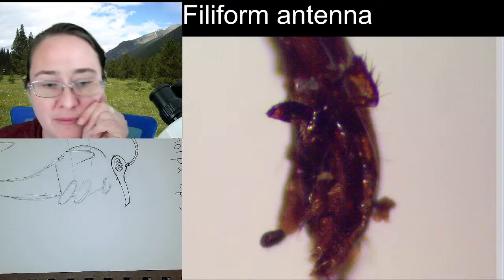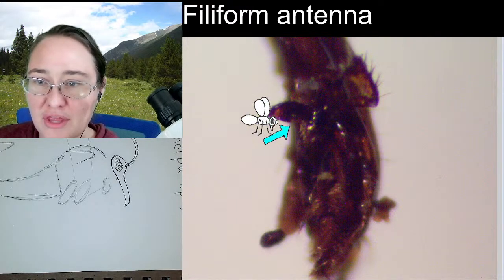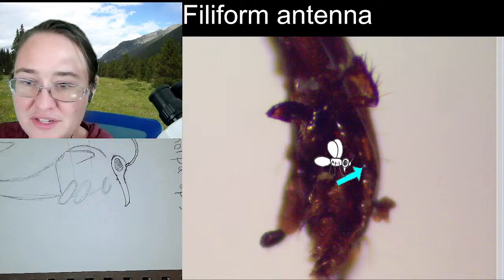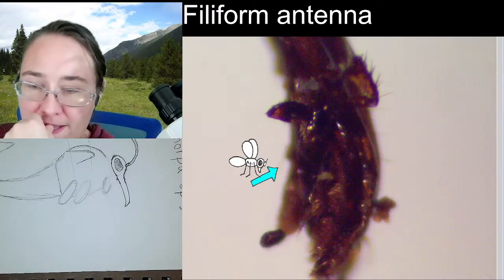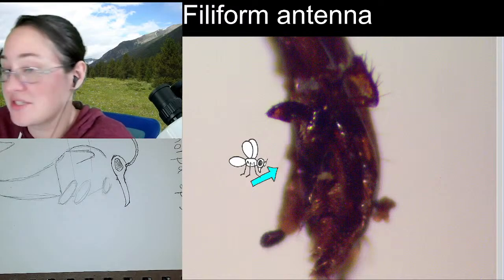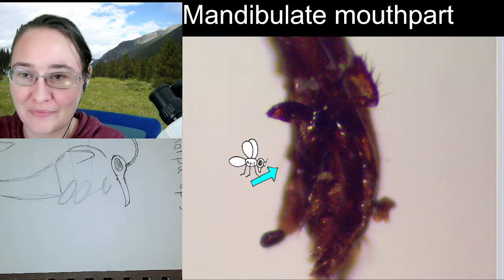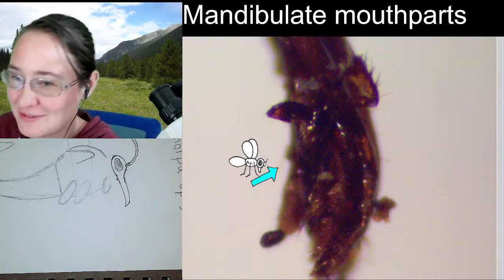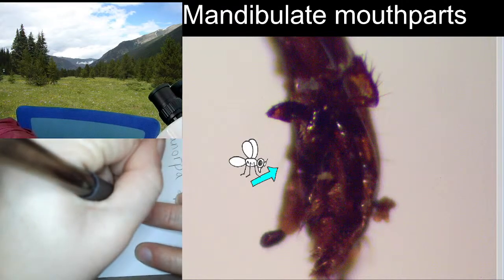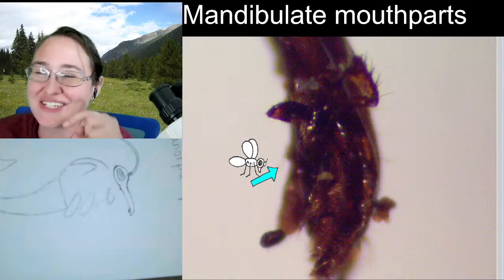We can see some of the palps and we can see the mandibles here. This here and here — those look like palps to me. And then right here is that mandible on the close side. So we would consider these chewing mouth parts, or we could call them mandibulate — that's fun. Mandibulate mouth parts are any mouth parts that have mandibles.